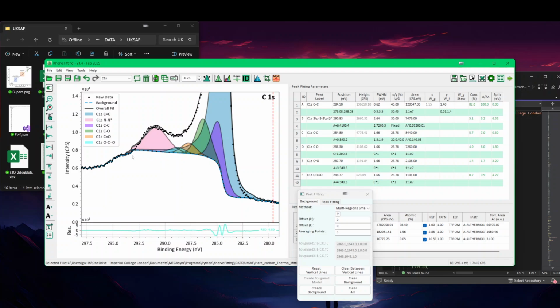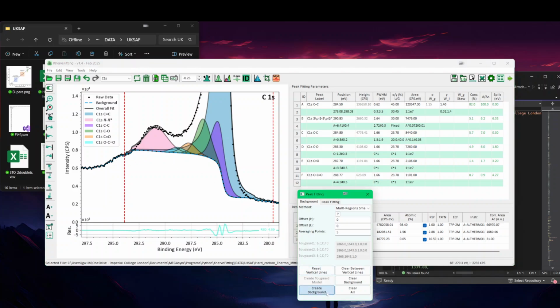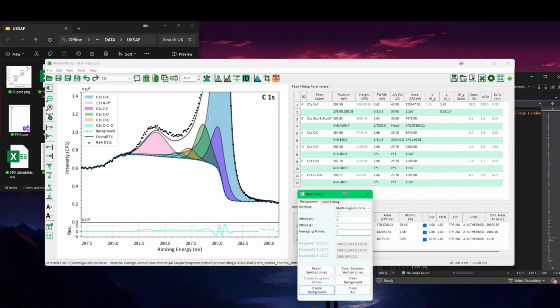from here. And I tend to not include the second pi-pi star because from what I've realized, most papers, or at least the Bissinger paper, do not seem to include it. So the area shown here, which is from the paper, would have to be way larger. So the A times 0.072 I've used will have to be way larger if I include the next pi-pi star. So now it's all done.